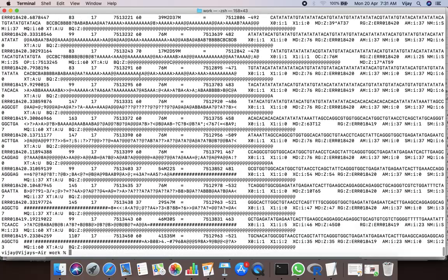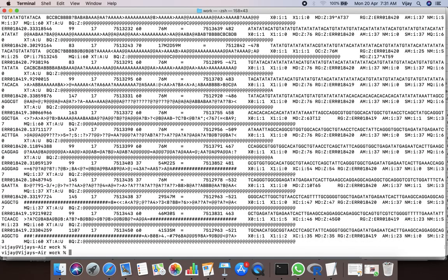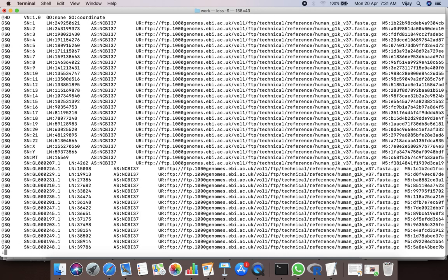To display the content page-wise, you can redirect the output of this command into another command called less with the flag -S.